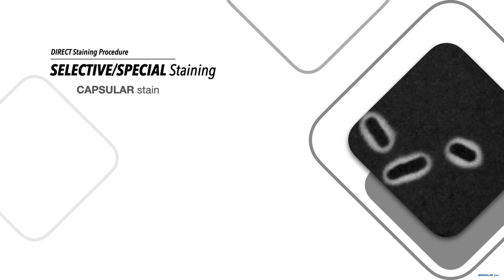And in identification of the bacteria, guys, again, the presence of the capsule will help in determining the proper medical intervention to combat this pathogenic feature, the capsule, and eventually to kill the bacteria that causes the disease in question. Okay. And like your endospores, your capsular staining do not absorb most times. In fact, mas nakaka-absorb yung endospore. Your capsule not really. Okay?